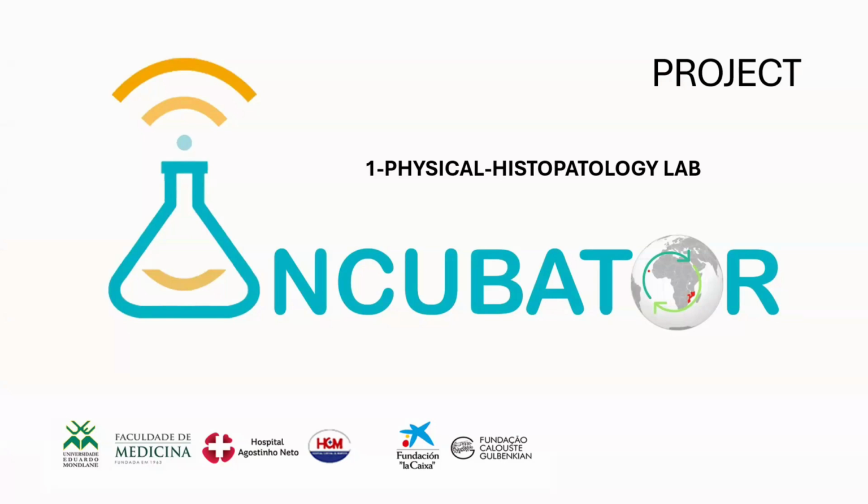The University of Cabo Verde is located on Santiago Island, in the city of Praia, and is organized in two faculties. I belong to the Faculty of Science and Technology, where we use light microscopes in microbiology and cell biology classes. And we implemented this lab.